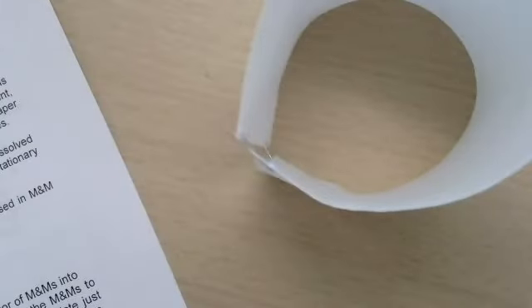The beakers have parafilm covering them. Parafilm is the greatest saran wrap. It is non-permeable. It doesn't allow stuff in, and it won't allow stuff out. When it's stretched, it gets sticky, and so if you just push on it, it'll stick to the beaker and then seal it. So to open, just gently pull off. If it rips or anything, just let me know. I'll get you a new piece.